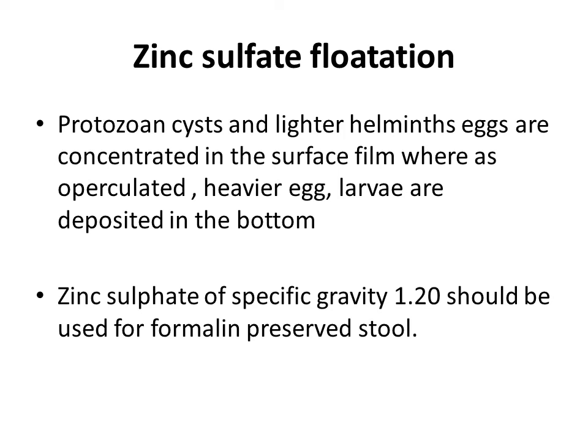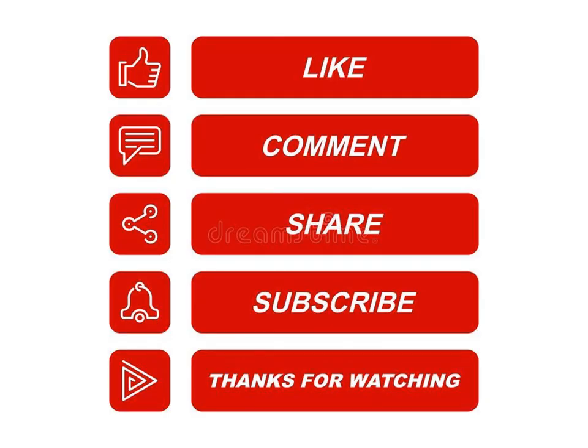And here the disadvantage is that we have to keep the specific gravity always at 1.2. Another advantage is that we are using formalin, which preserves the sample and reduces the odors. Right. Okay. Thank you very much.